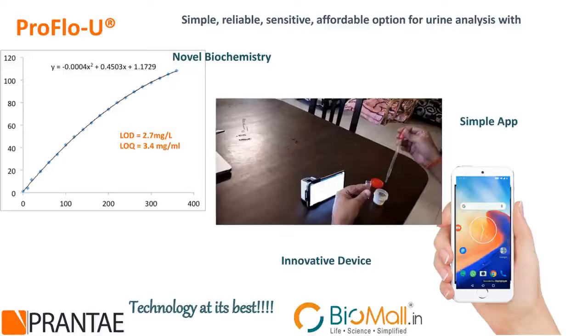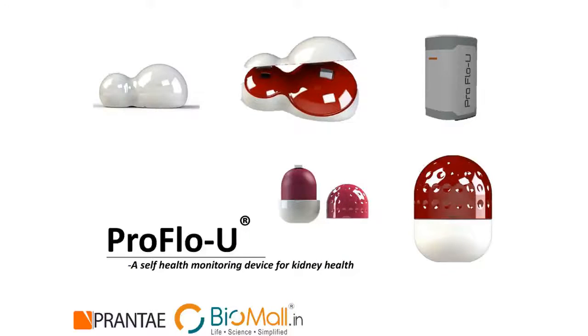Now, let me just tell you that this kind of LOD is equivalent to the sensitivity observed using the ELISA-based method for microalbumin measurement. So these are the different formats that the device is designed to be. The format on the top extreme right is a clamp-on adapter for mobile phones or smartphones, where you can use the camera of your smartphone as a measurement device, and you can do this assay.